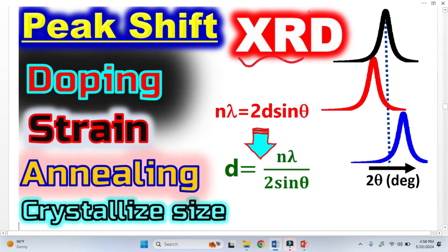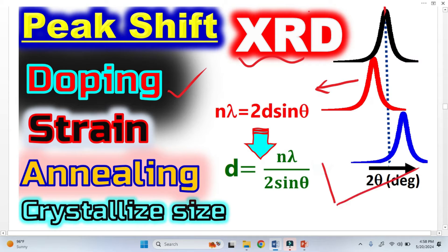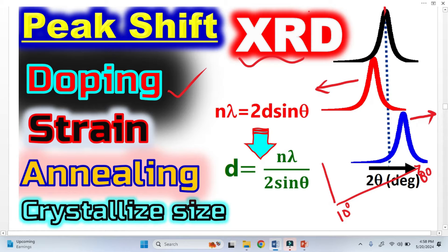Peak shift in XRD occurs due to four reasons. Peak shift basically means the original peak is at an original 2-theta position. Sometimes the peak shifts toward the left, which we call lower 2-theta, and sometimes toward the right, which we call greater 2-theta.